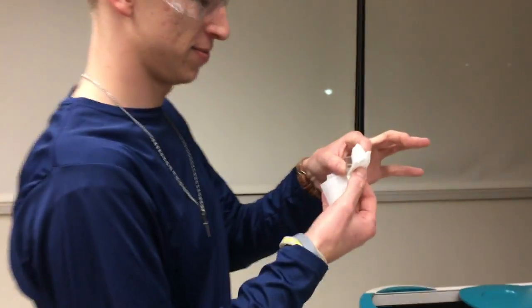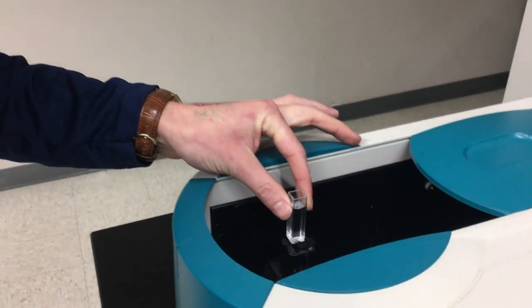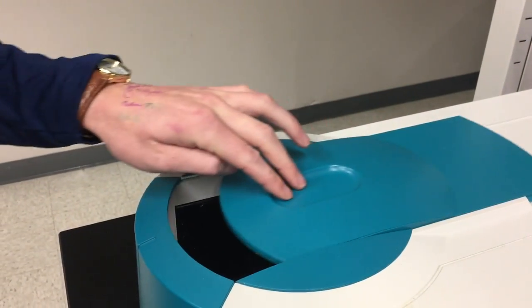When using a spectrometer, it is important to zero the machine. If you do not zero it, then you will probably get a larger absorbance reading, which will mess up your data and not allow you to find the right concentration value.